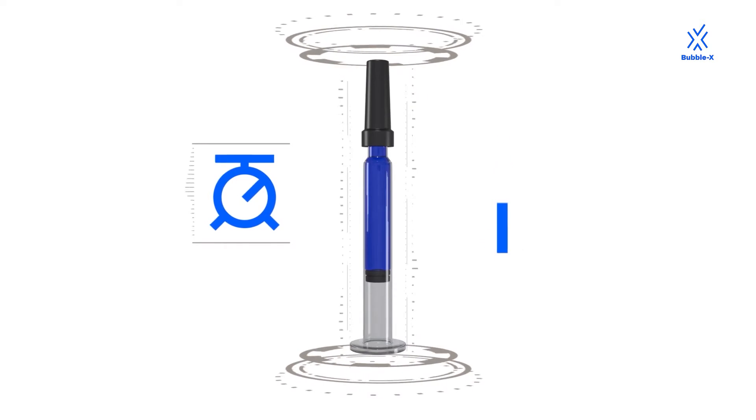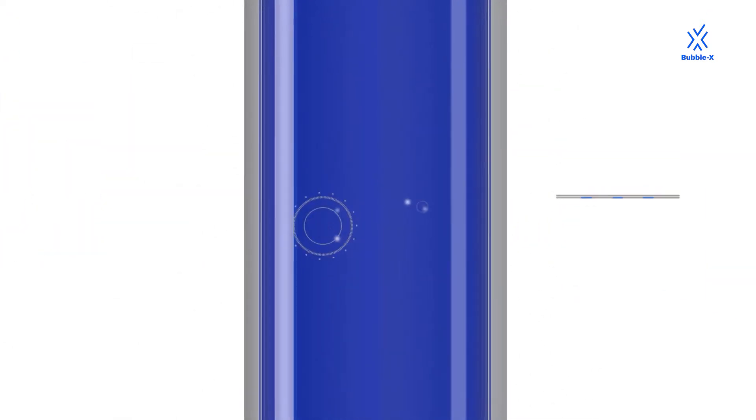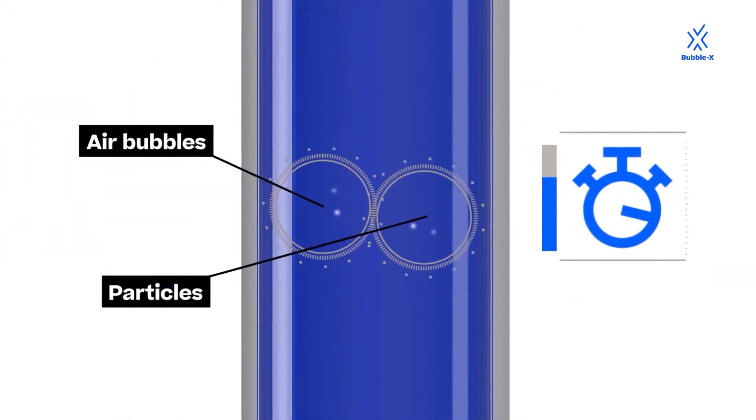In high-performance inspection, there is no time to wait for the effect of gravity to separate air bubbles and particles.